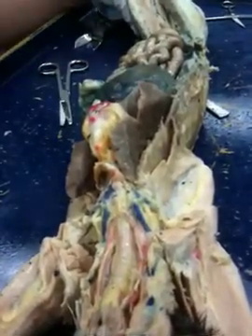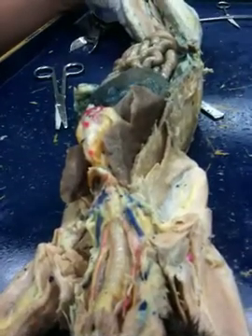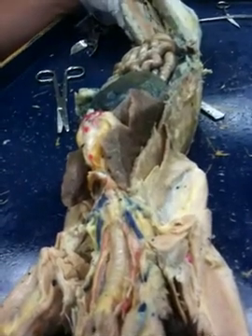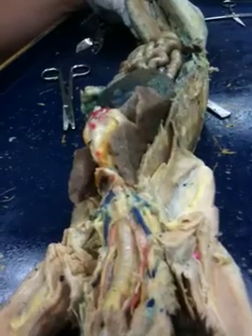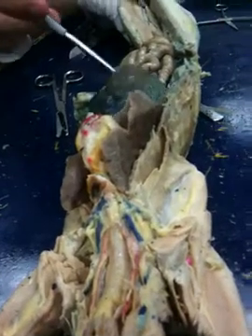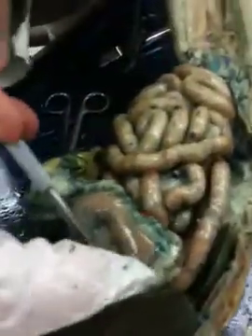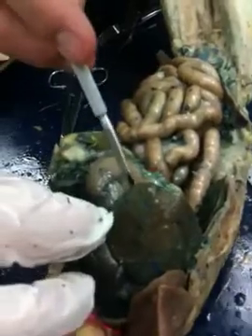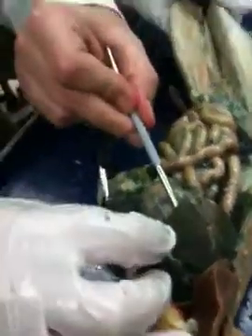Lungs, diaphragm, esophagus, we already went over that. Parietal pleura. You'll need to find the greater omentum. I told you where the falciform is, gallbladder. Common bile duct, if you lift that up, it attaches here to the duodenum. It's like that right there, attaching to the duodenum here. And it comes directly off of the gallbladder, which is right in there.